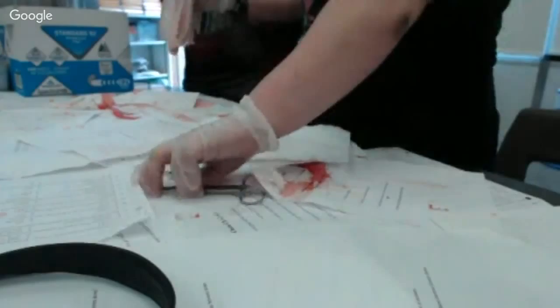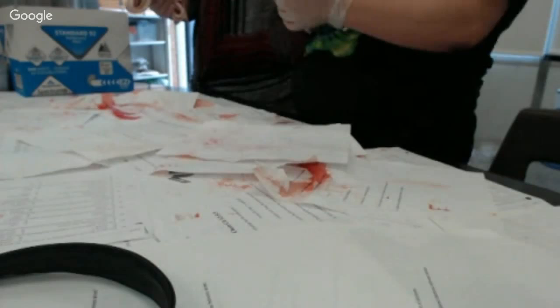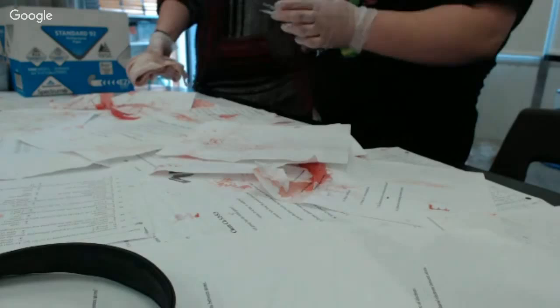All right, rinse the utensils, leave them over there. Now you've got some experience. Utensils need to be washed out. What do I do with the skin? Are you keeping it? No, Mr. Taylor's keeping it. Well, put it in the box. I'll take it. All right, go do this, and I'll get all the paper.